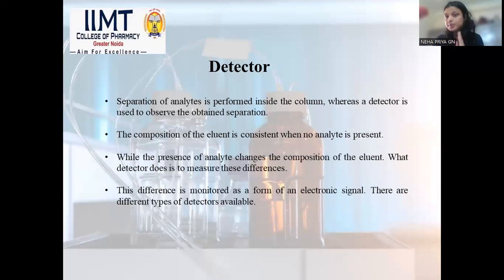The only limitation HPLC gives us is that we need to understand the retention time of each component. I have to understand the retention time, or the standard time, of each component, and only then will I get to know the result. So this is the limitation HPLC gives us, yet it is one of the most accurate techniques, and most industries, whenever they buy some raw material, want a COA with the HPLC result.